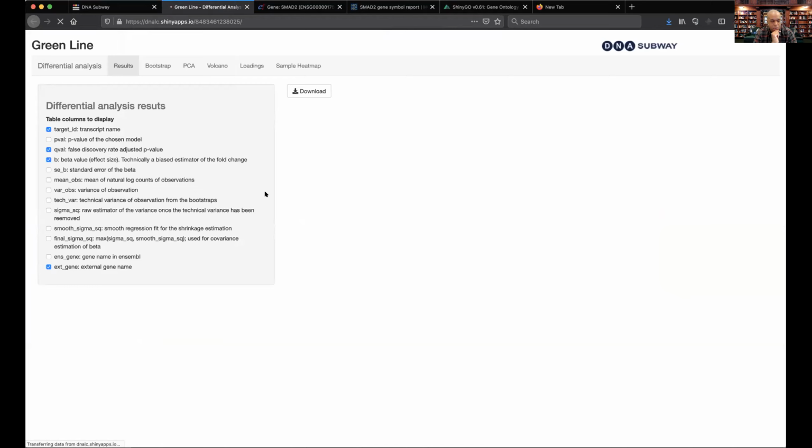It's really nice. Although if you downloaded these data and then wanted to, you could use R to go ahead and study it further. It's a rather large data set, so it's just going to take a minute or so for this all to load. So we'll just wait a moment for that to happen.